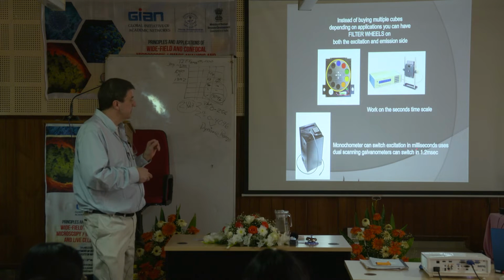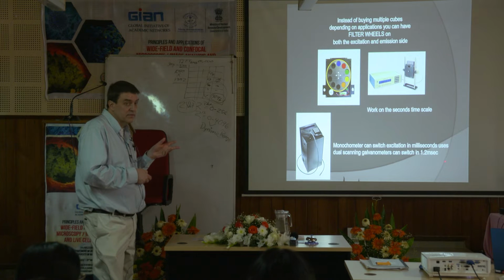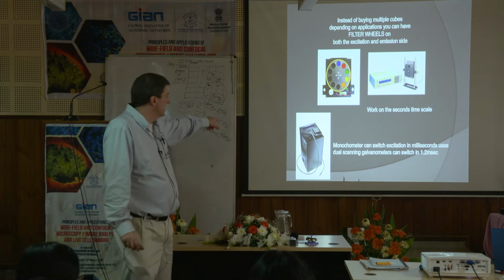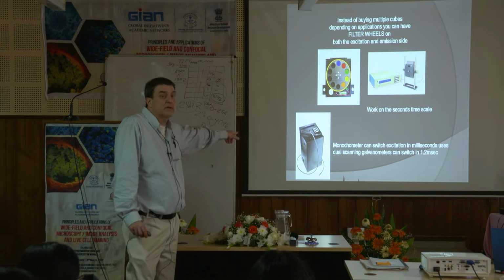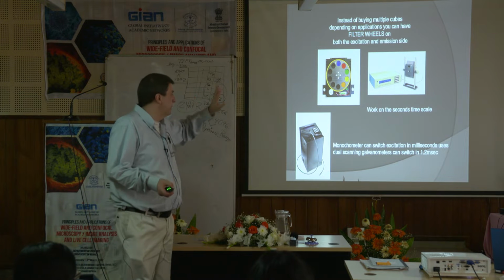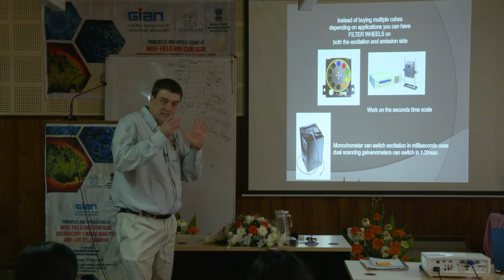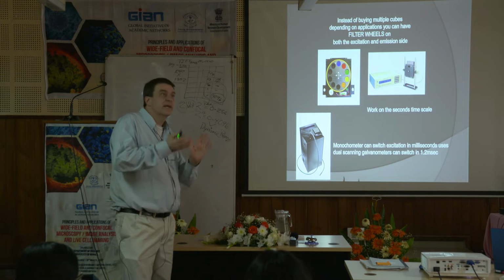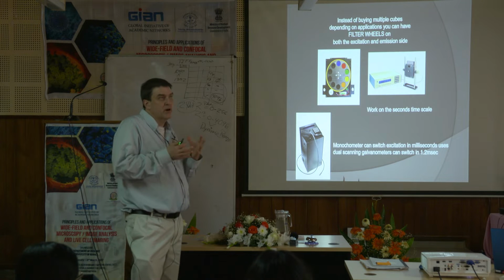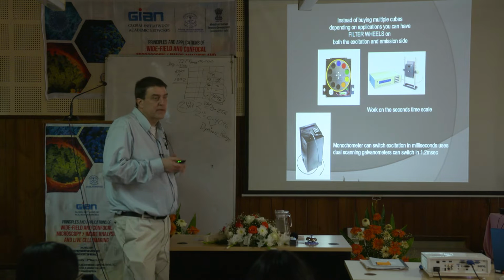Now, the other thing to think about is if you're switching that fast, only a little bit of light's coming through. Remember what we talked about earlier? We talked about different cameras. So if you end up buying something like this, you want to go fast, you better get a camera that can match up with that. Okay? So this is not like, I buy a microscope, I buy this fluorescence, I buy this camera, I'm good to go. You've really got to depend on your sales rep to steer you in the right direction. And like I said, feel free to check with me, my knowledge just to put it in there, because if you buy the wrong stuff, it just won't work for your application. So you've got to make sure you get the right stuff.